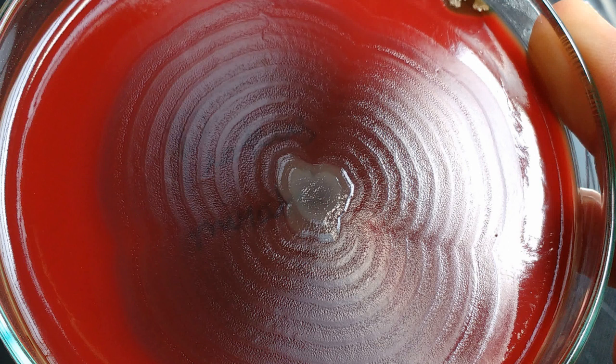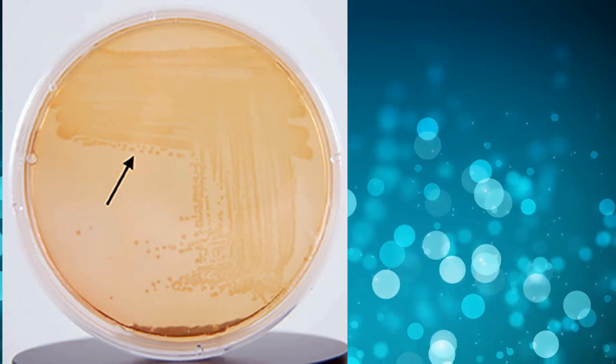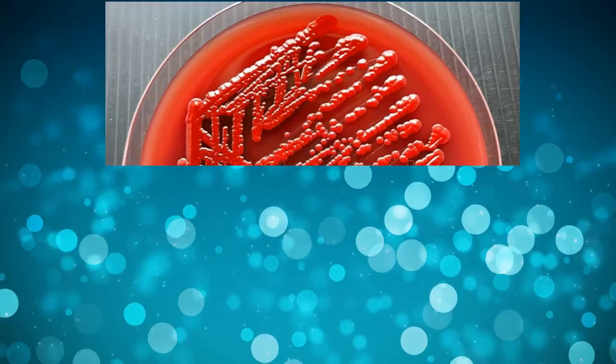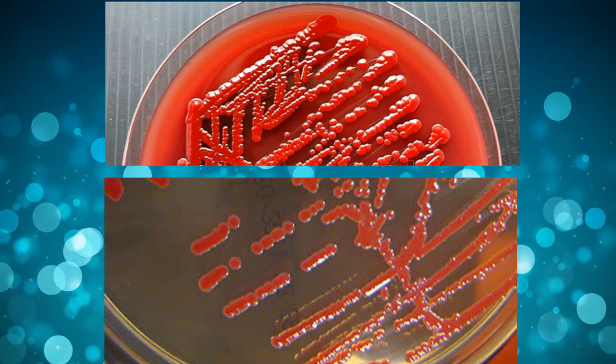We have covered pinpoint colonies and large colonies, but Proteus species shows a swarming growth on blood agar and it is difficult to find single discrete colonies after overnight incubation. This feature makes it easily identifiable. Bile salts in MacConkey agar inhibit swarming of Proteus and shows non-lactose fermenting discrete colonies on it. Proteus growth also has a typical fishy odor. Serratia marcescens produces typical red pigment on blood agar and MacConkey agar and colonies appear red on both media.